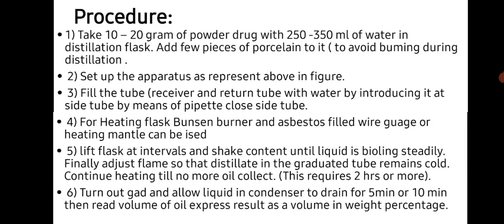Finally, adjust the flame so that the distillate in the graduated tube remains cold. Continue heating till no more oil collects. Turn off the gas and allow the liquid in the condenser to drain for 5 to 10 minutes. Then read the volume of oil and express the result as a volume in weight percentage.